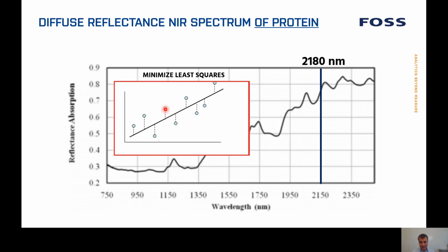And the least squares is simply the distance from the point to the line. In this case, we square this distance and then we sum it for all the data points here. And when we do that, we're going to fit the line that minimizes these distances seen over all samples. And this is called the least square solution, the linear least square solution to this equation.